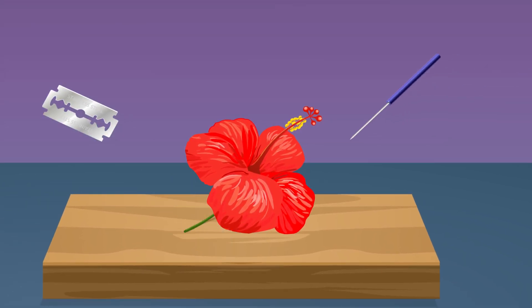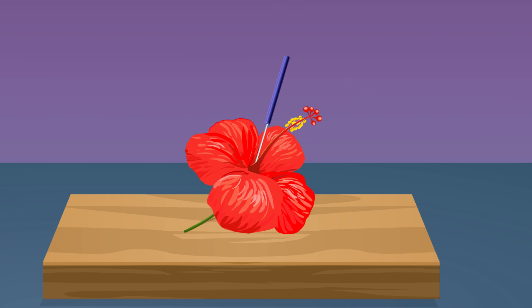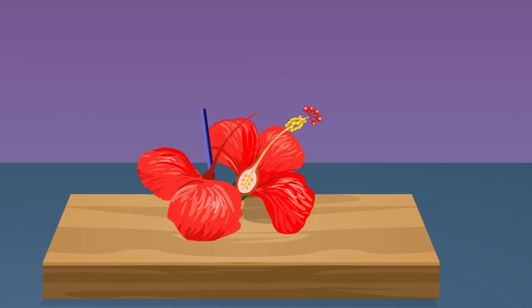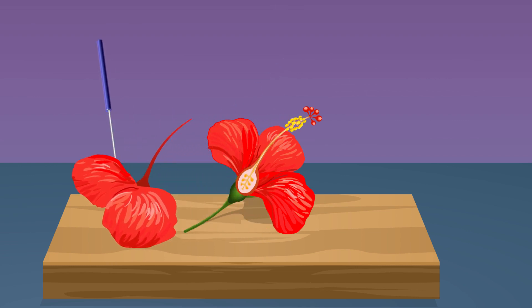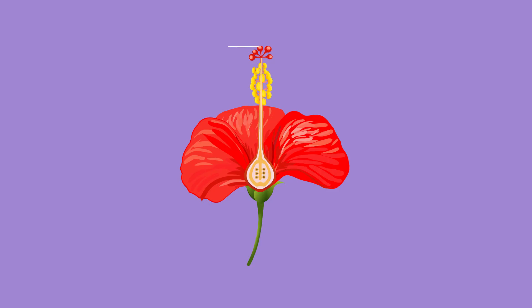Spread the two halves of the flower side by side using a needle. Place a white sheet of paper over the table. On the paper, arrange the two floral halves and observe the parts of the flower.